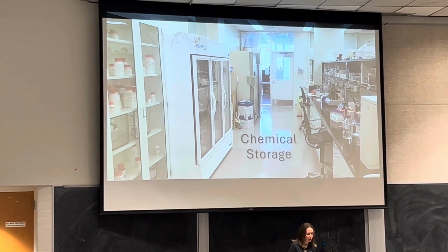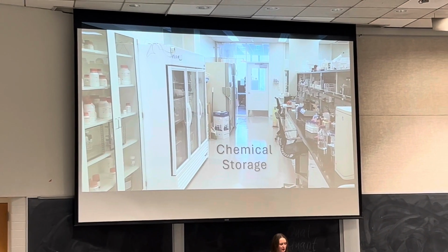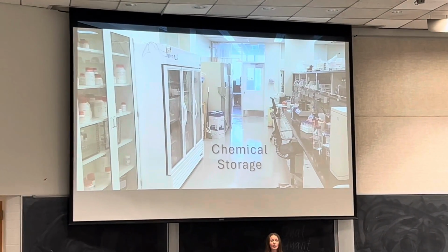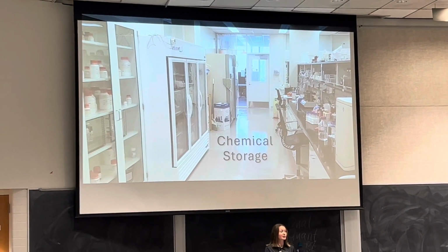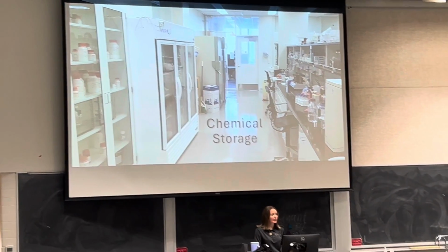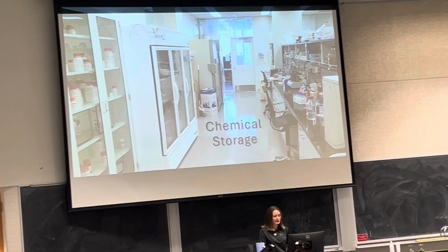meet him. All right, this is our chemical storage. This is where you'll get your standards that you'll run to calibrate your instruments. Will be over here, and also any other reagents that you need for your sample prep and your sample analysis.